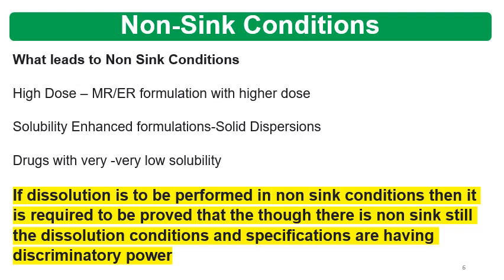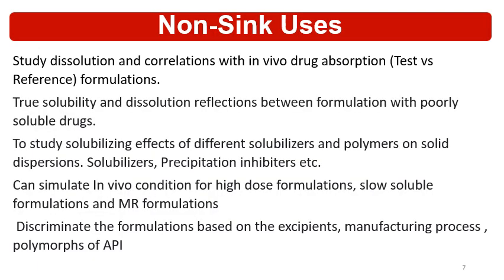It can be proved based on different formulation designs and with different technologies. So use different formulations, use different technology for making the formulation, and prove that the dissolution conditions are discriminatory though there is a non-sink condition. Now non-sink conditions are used in research and development and also in many QC dissolution testing. So what are the uses?